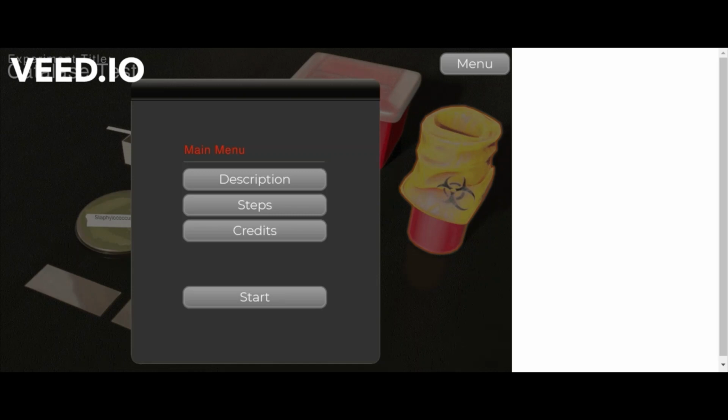But if no bubble is formed on the slides, the microorganism is called catalase negative because it does not contain the enzyme catalase.